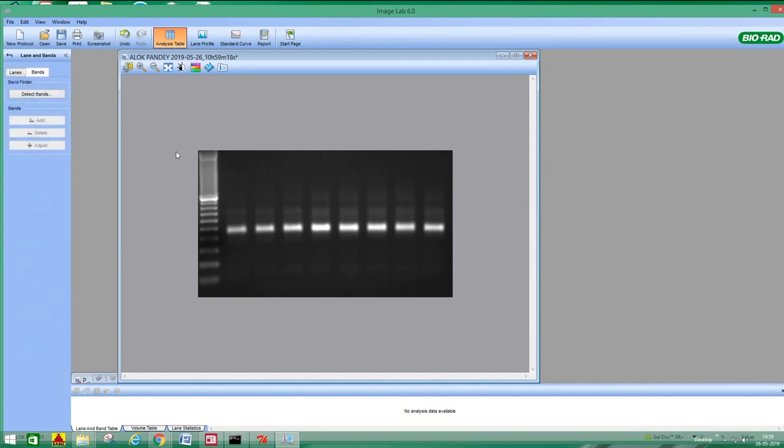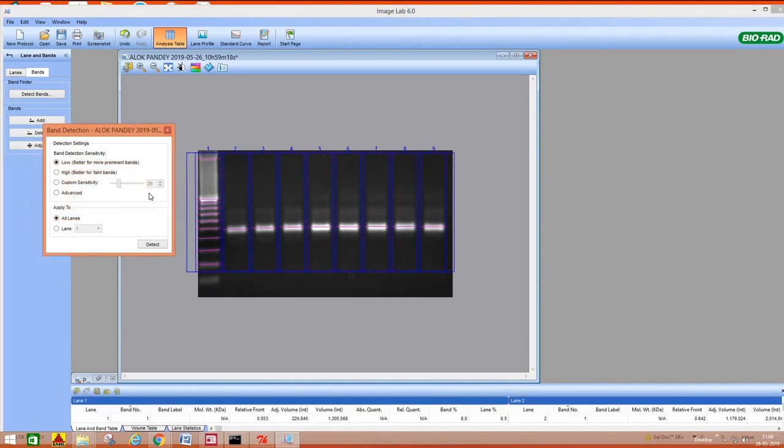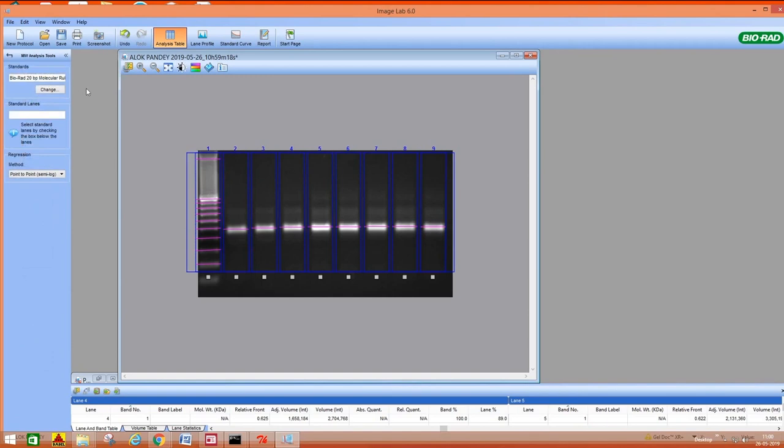After that, lanes and bands. So it is exactly the same protocol for proteins and nucleic acid also. It will detect the bands, better for prominent bands. So after that it detected lanes and bands also.